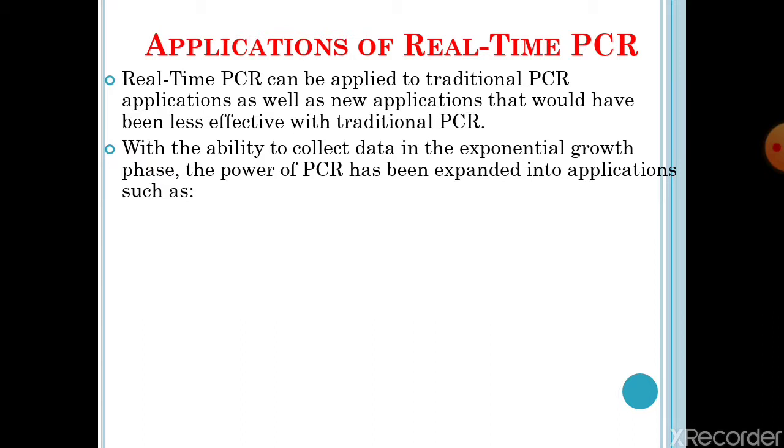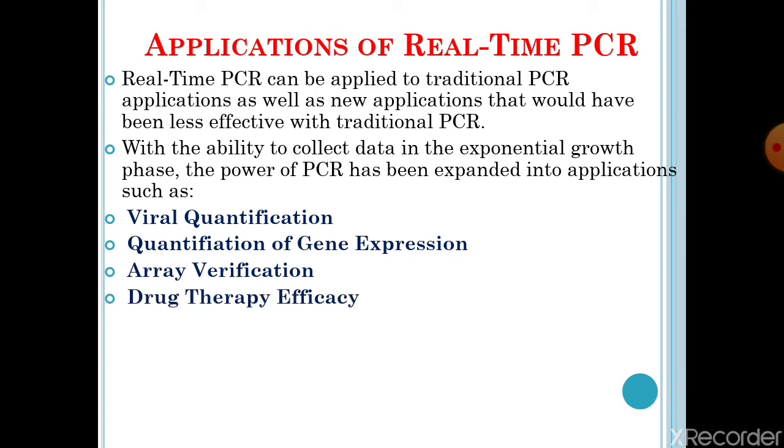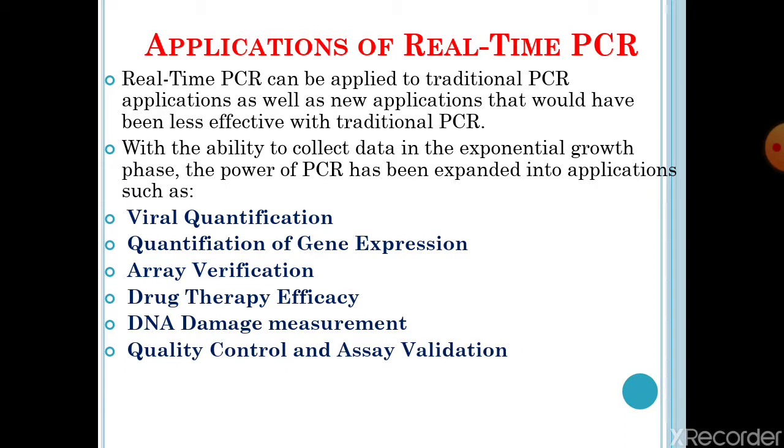With the ability to collect data in the exponential growth phase, the power of PCR has been expanded into applications such as viral quantification, quantification of gene expression, array verification, drug therapy efficacy, DNA damage measurement, quality control and assay validation, pathogen detection, and genotyping. So these are some of the applications of real-time PCR.